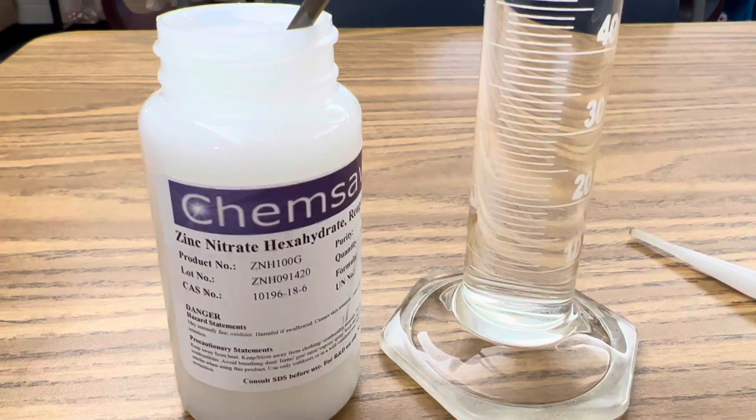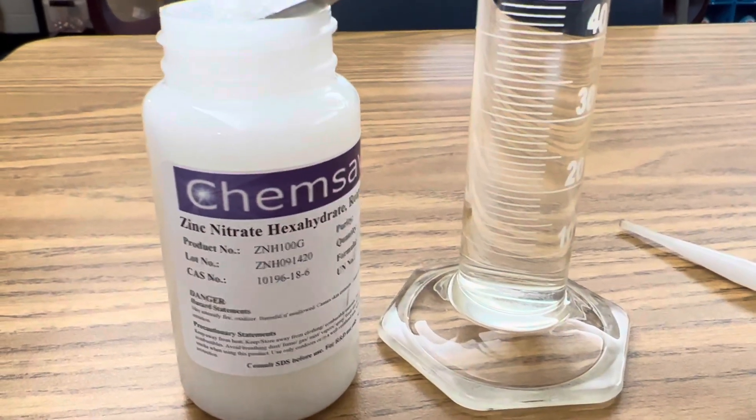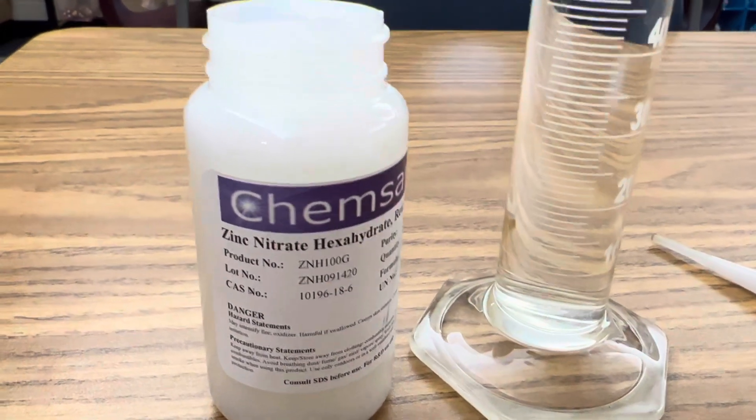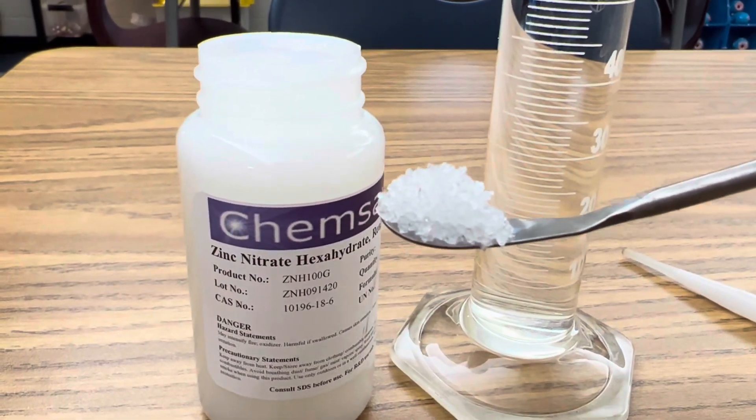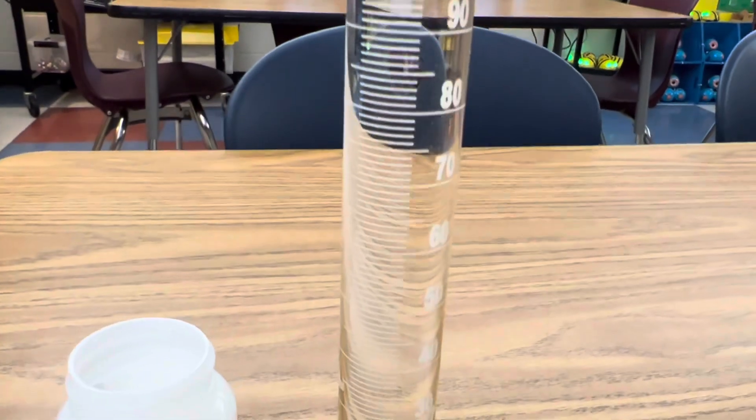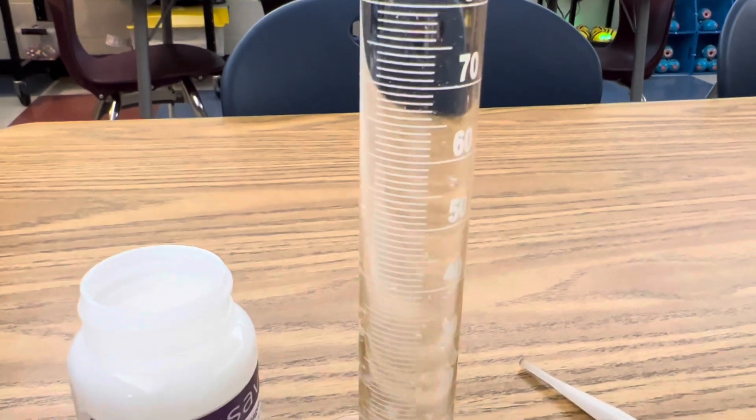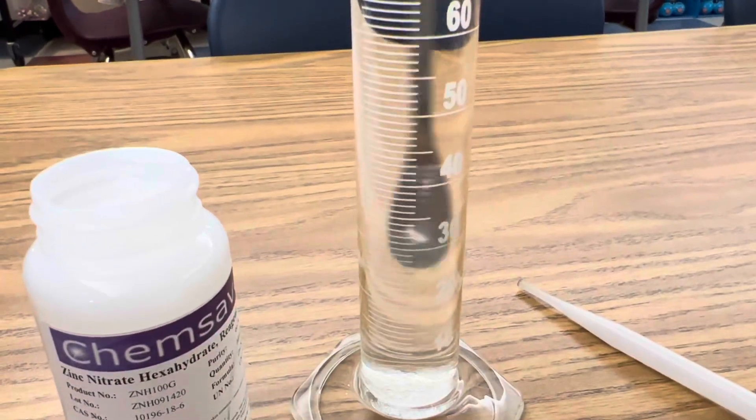Next, add four grams of zinc nitrate to 100 milliliters of distilled water in your graduated cylinder. You can see this is a white crystal. And stir your solution until it's aqueous.